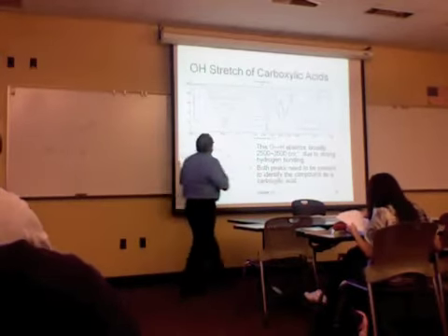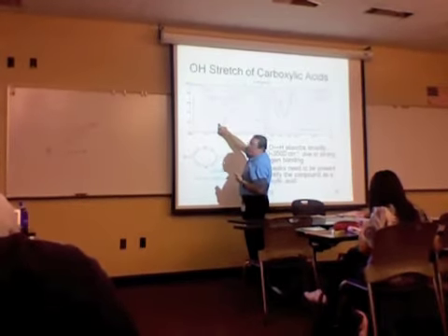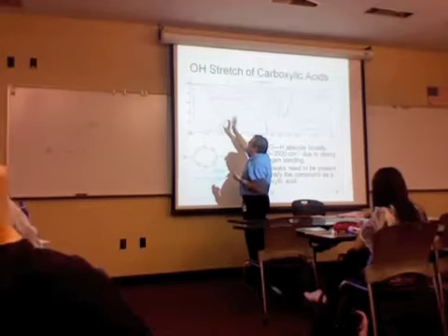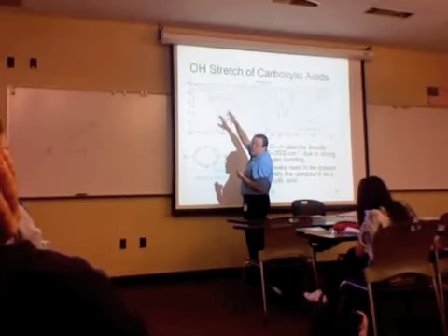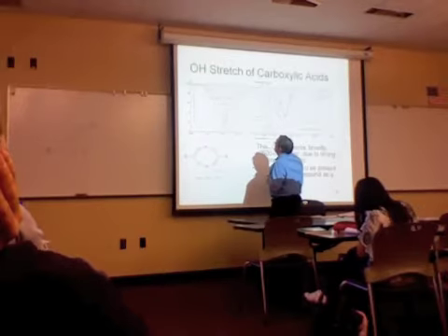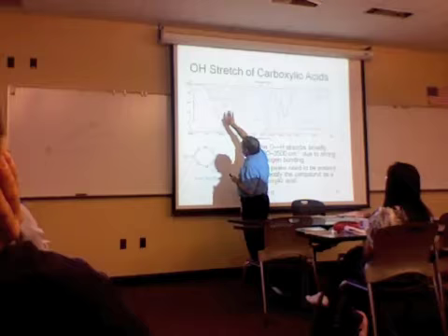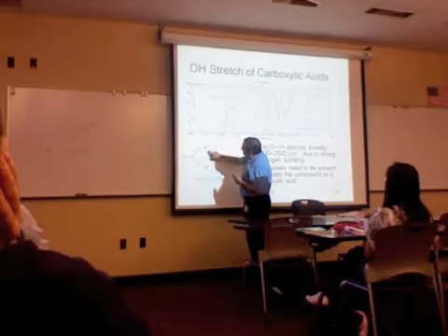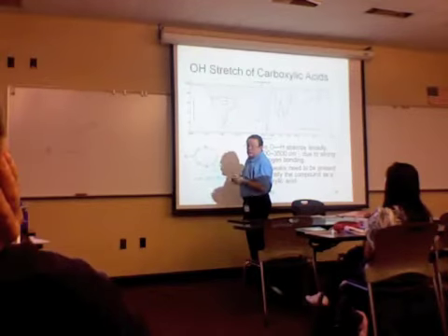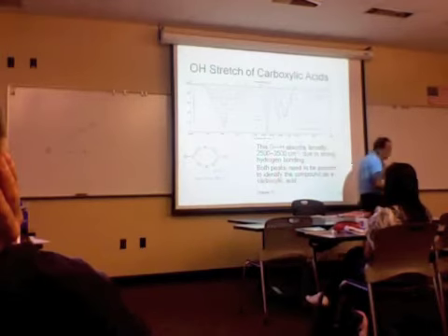Yes, the regular carbon hydrogen stretch is still below 3,000, or if there's double bonds, they'll be above 3,000. The problem is that they'll be superimposed on this broad, ugly band the OH of the carboxylic acid gives you. And again, it's farther down in energy because these bonds have been further weakened by extra hydrogen bonds. Okay, and broader than usual as well.